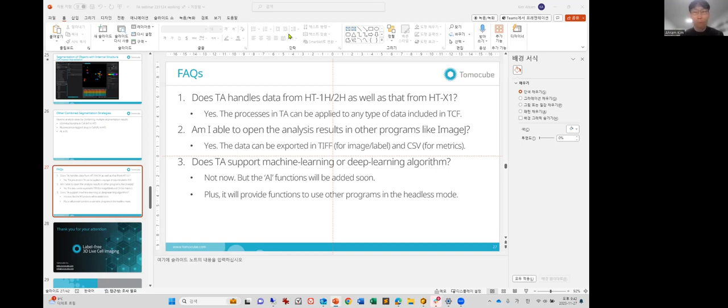So we are searching for better segmentation analysis, and at the moment we have two strategies for that. Mitochondria, when segmented, look like fibers. So the shape of mitochondria can be used for the segmentation.